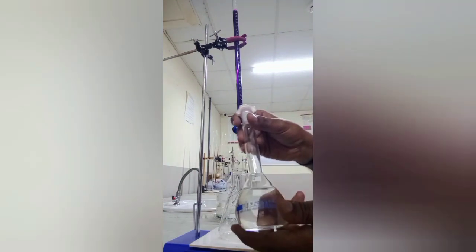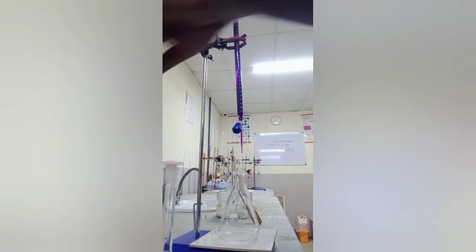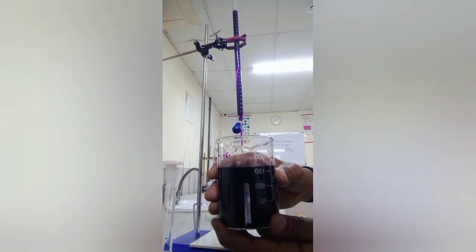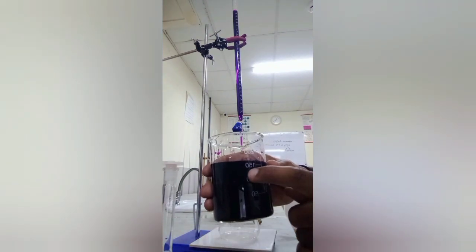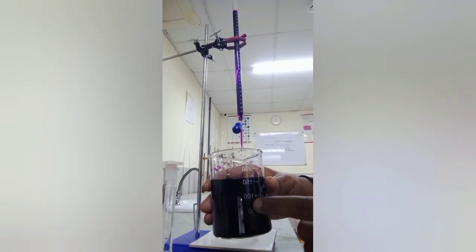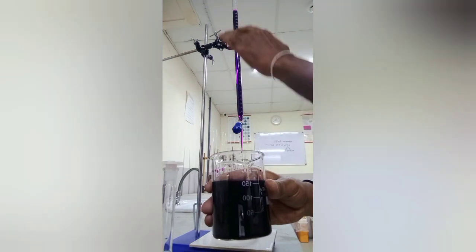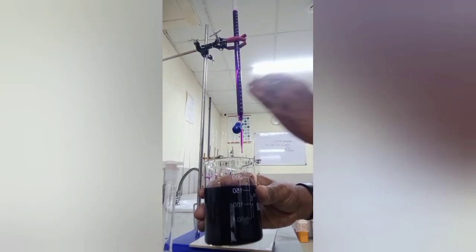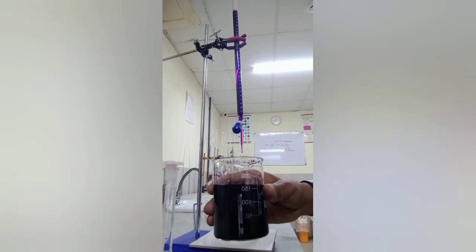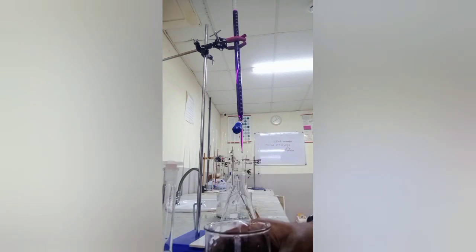As we finish the preparation of FAS, the first part is over. Now we are going to focus on the second part. During the examination the teacher will provide the KMnO4 solution in this beaker, and you are provided with only 150 ml. That means you have to do 3 titrations, and one burette is 50 ml, so 3 times means 150. You are not going to use 50 ml continuously in one titration, so it is less. Above 150 ml we are not supposed to be given during the examination. Within 150 ml you have to finish the 3 titrations and get the results.